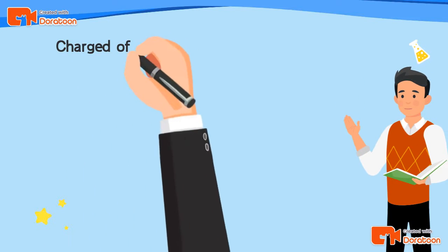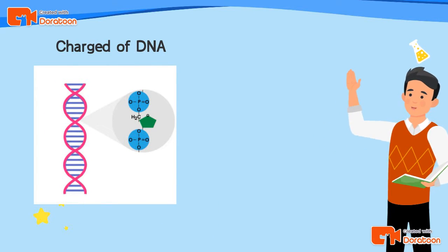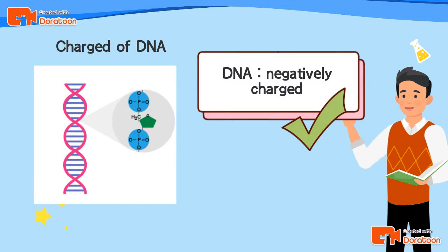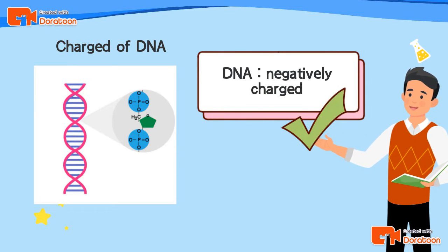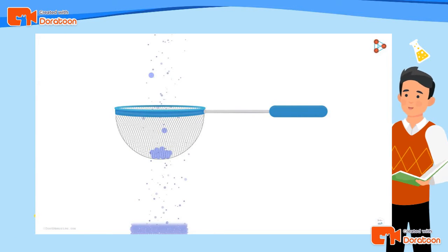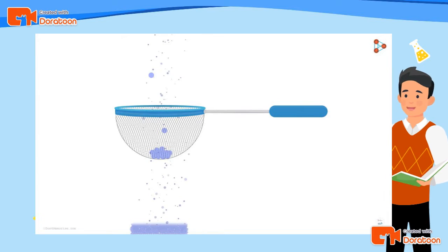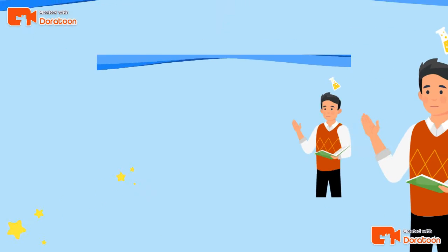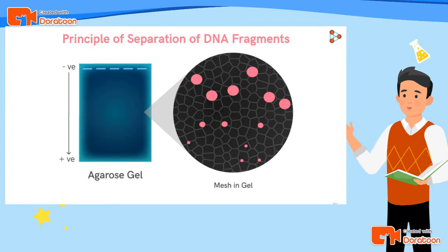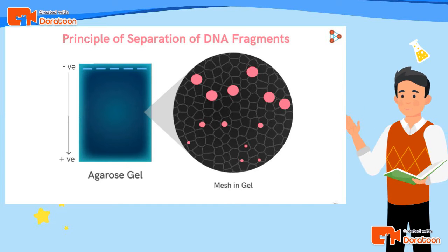Since this separation method is based on the charge of the molecules, what is the DNA charge actually? DNA is negatively charged because there are phosphate groups in the backbone of the DNA double helix. Since not all fragments move at the same pace, the small sizes will move quickly ahead while the bigger sizes will move slowly. When our DNA sample containing various size fragments is loaded onto the gel, the charge applied across the gel helps in the mobility of these fragments.